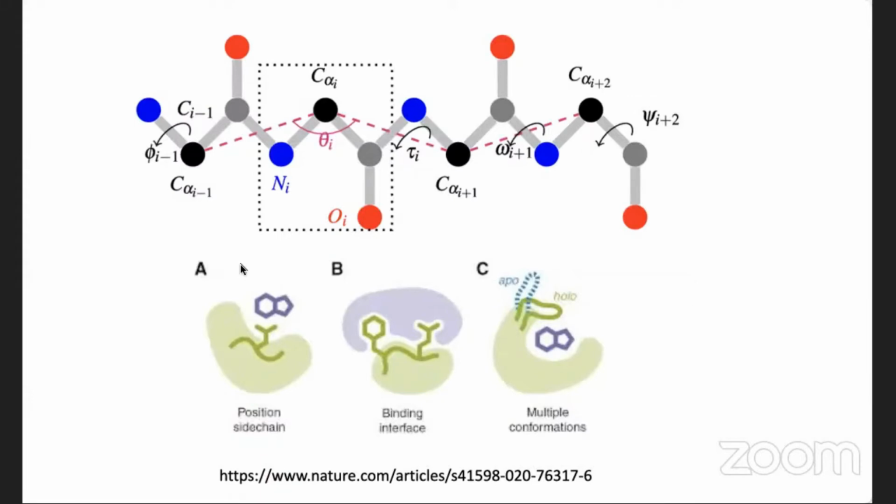And the image below shows different conformations of maybe a loop region in a protein, and that itself can change the function of the protein and the interface. And having those multiple conformations allows ligands to bind, or specificity, which is very important in drug discovery and drug designing. So prediction of protein structures via the representation using backbone dihedral angles that you can see on the screen has recently achieved significant progress.